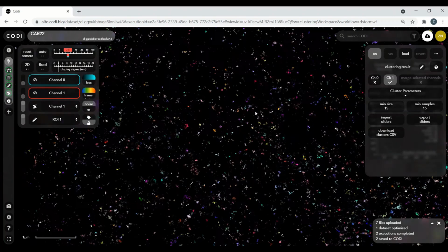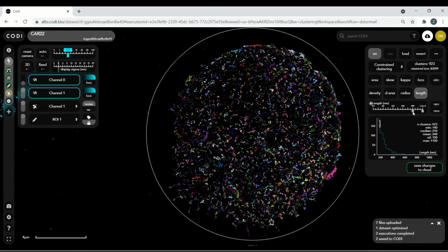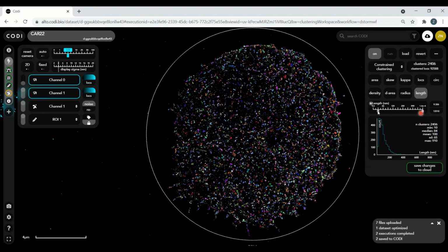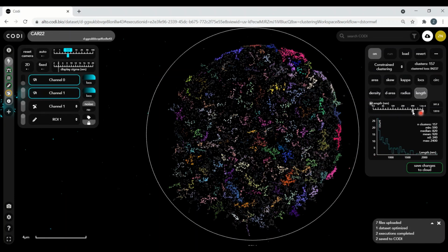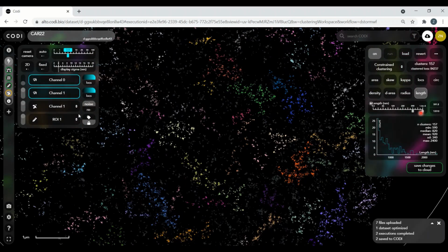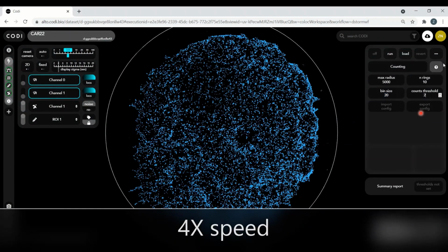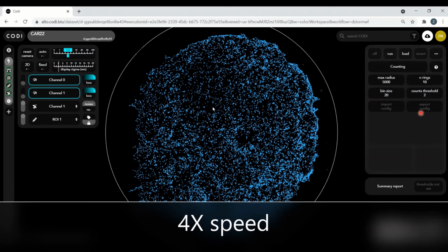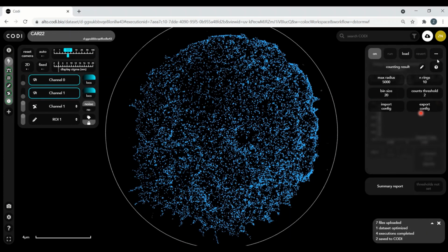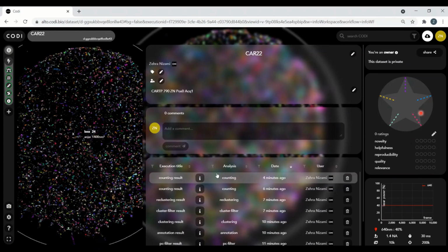And here I'm running what we call our clustering algorithm. This clustering algorithm finds where the localizations are and how they relate to perhaps individual molecules. But furthermore, by adjusting the length scale with this slider, you can start looking for nanodomains, how the localizations correlate to molecules, which then may correlate to higher order nanodomains, shown here in multicolor. And here I'm flipping on and off the filters of the clusters over the localizations themselves. Furthermore, you can run counting tools where you can find a sense of how many molecules or localizations or whatever features you're looking for within certain regions. Here I'm showing you the counts that are coming back for that particular region.